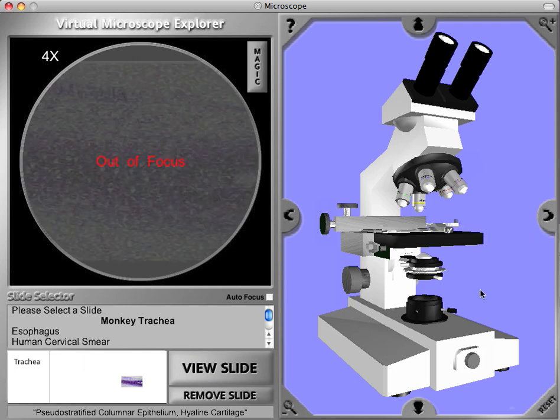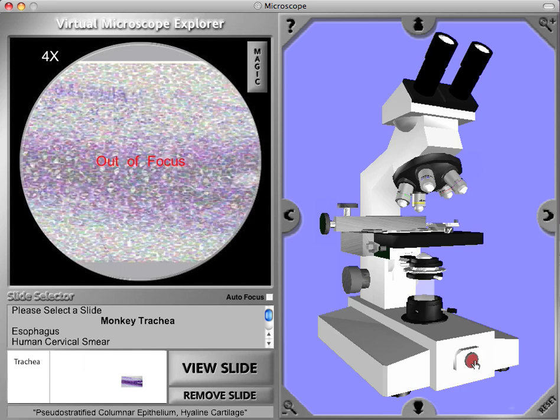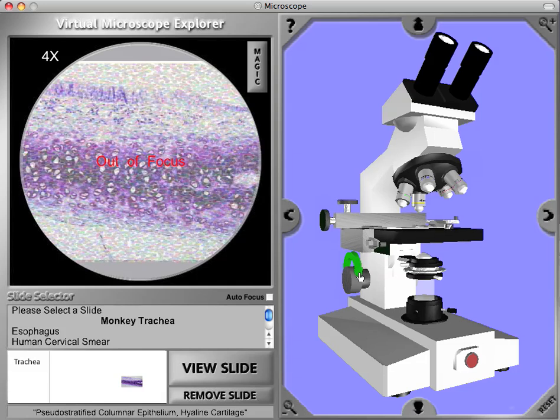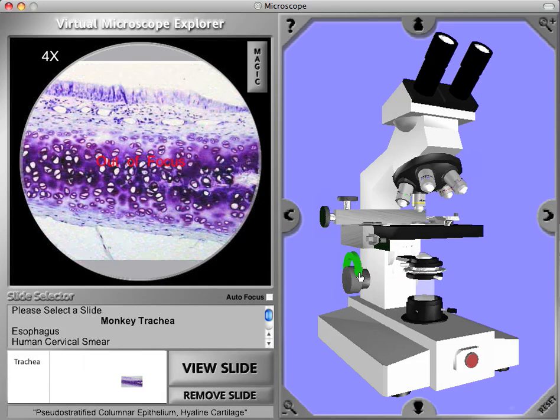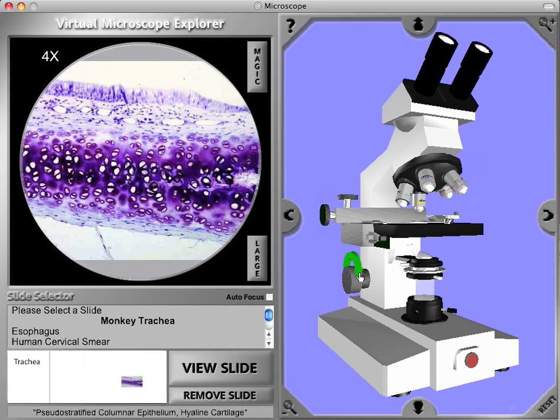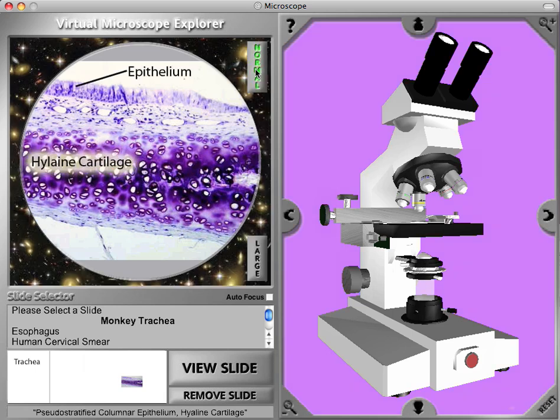Just like a real microscope, we have to turn the light on by clicking on the power button at the base and focus the microscope by putting the hand on the focus knob and simply mousing down. When the specimen comes into focus, we can view the magic mode, which shows labeling of salient features of the specimen.